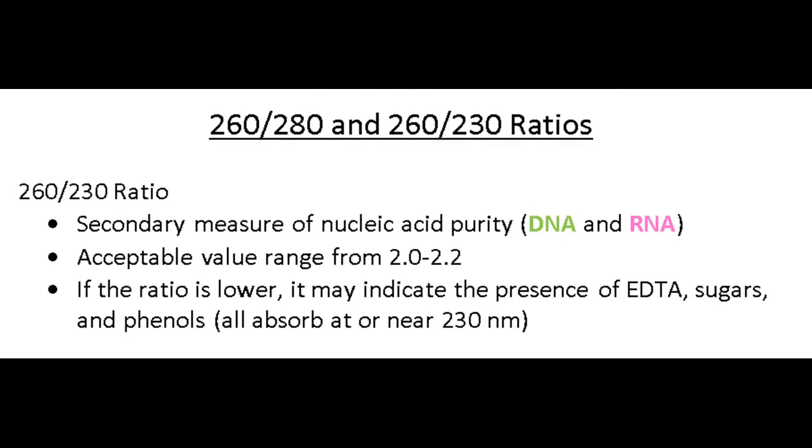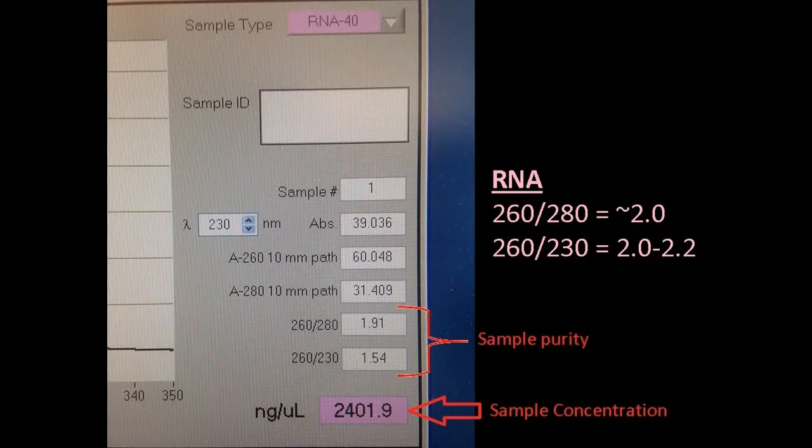The second value that you should take into consideration is the 260 to 230 value, which will tell you whether or not you have EDTA, carbohydrates, or phenol contamination in your sample, all of which absorb near 230 nanometers. Based on the ranges that I have here in pink, the 260 to 280 value of my RNA sample is acceptable.